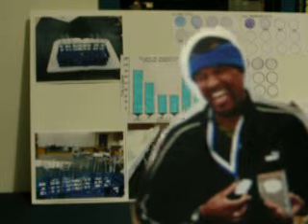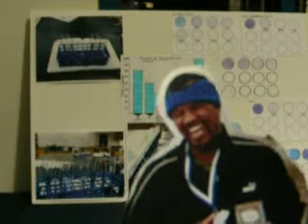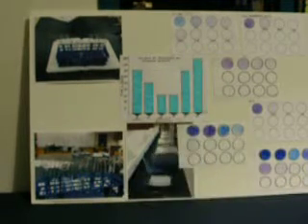Now I'll explain the graph. As temperatures are lower and higher than room temperature, the amylase activity decreases, taking starch longer to be converted to maltose. In regular room temperature, amylase activity is very quick.